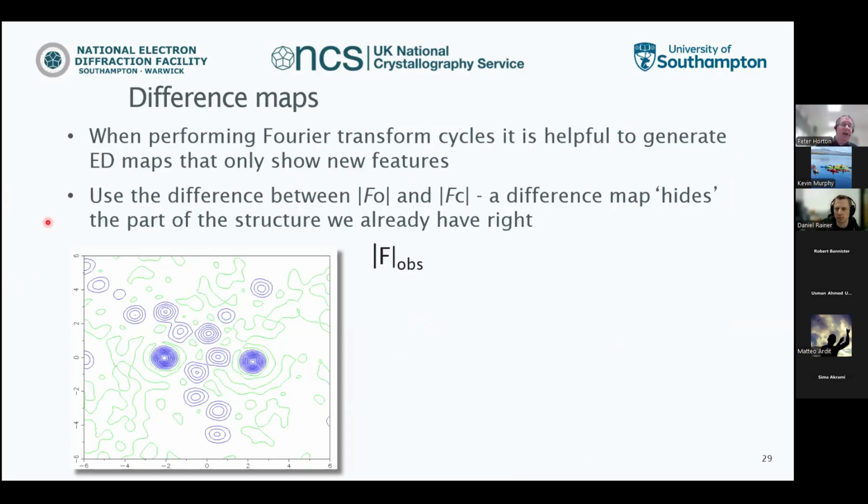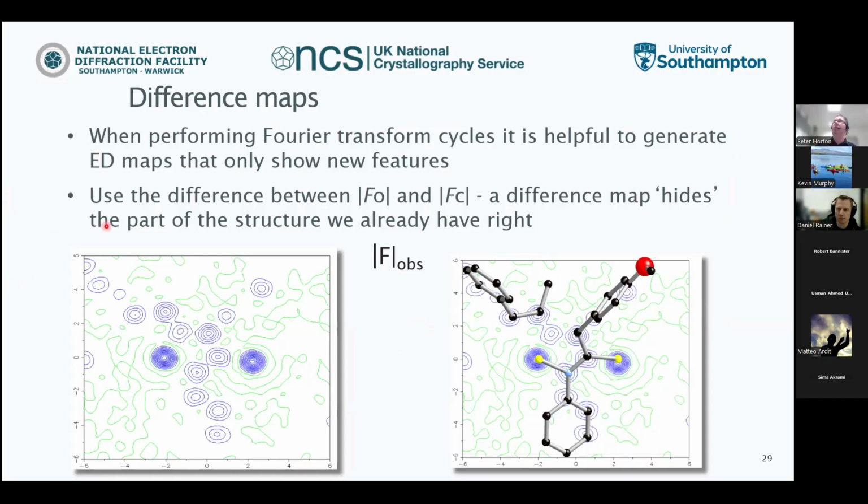We have just observed maps, so we can see our intensities. Okay, this is a 2D plate, and our crystal structures are 3D, but we can rotate around and see where they are. But you can see that the sulfurs in this structure and all the carbon atoms fit quite well. This area here, there's something going on, but we can't see it.